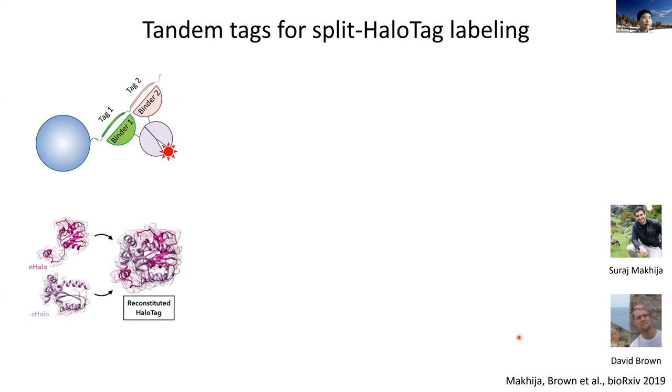So it has been very widely used in live imaging, particularly single molecule tracking in living cells.